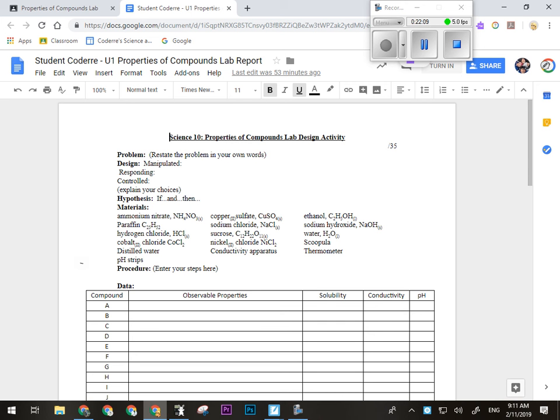And then I would say things like, if I want to use this depression plate and I've got all of my samples in it, what should I make sure I do to this plate? Yeah, be sure not to mix them. And if you do, it's not a big deal. Just get a new sample. There's more than enough holes here. Or when you're done, just dump it all out and try that one again if you screw up. And that's a big thing. If you screw up, just do it over. Just do that one over. Don't try to rescue it. Don't try to save the materials. It's wrecked.